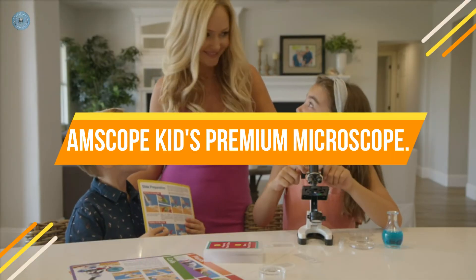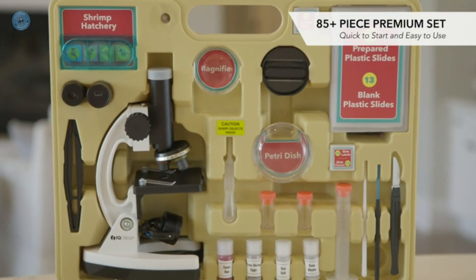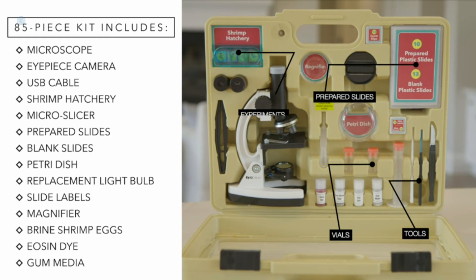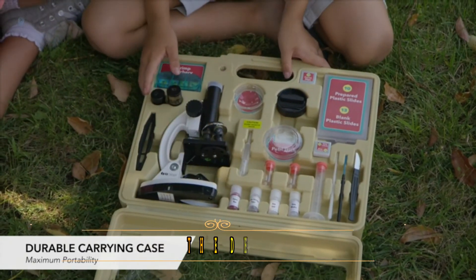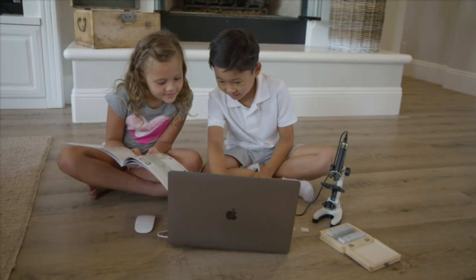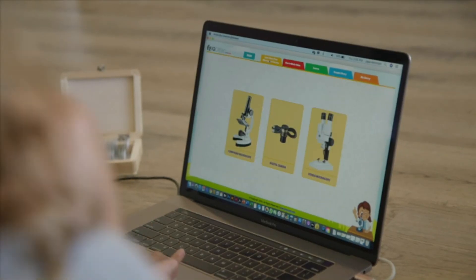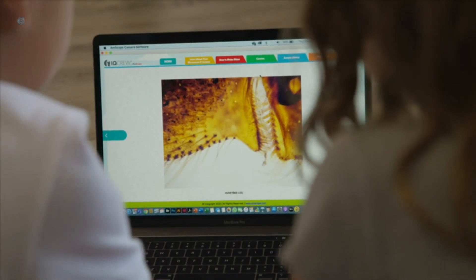Number 1: Amscope Kids Premium Microscope. All-metal high-quality microscope with precision focus optics, magnifications ranging from 120x up to 1200x, easy focus system, two light sources, a built-in color filter wheel, and much more. Premium at-home or in-school lab with over 85 accessories and a newly designed ABS carrying case. This premium kit includes a color digital USB 2.0 eyepiece camera that allows your child to easily connect to a computer and download or edit pictures of specimens directly from the microscope. Save images or videos of any specimen being examined for school projects, to send to relatives or friends, or to compare to professional samples.